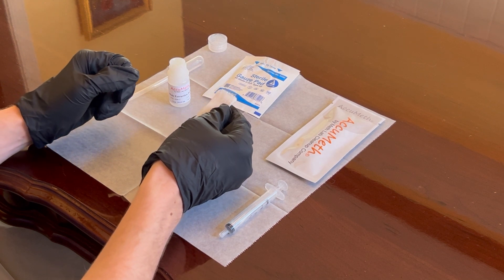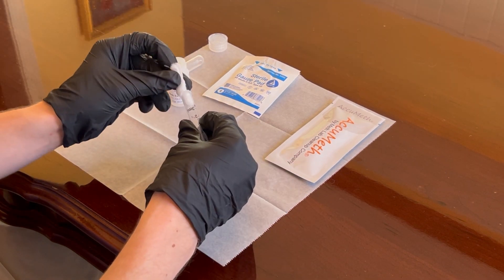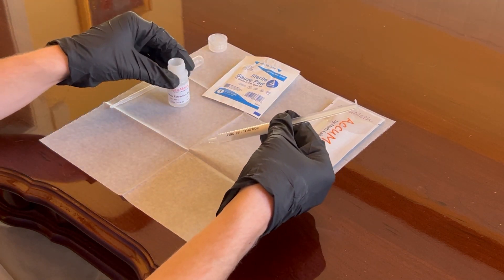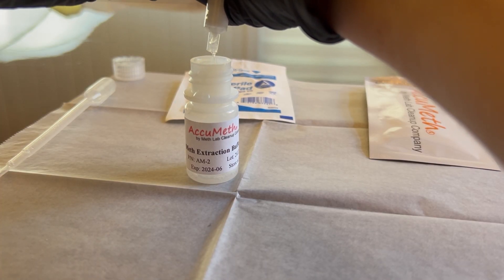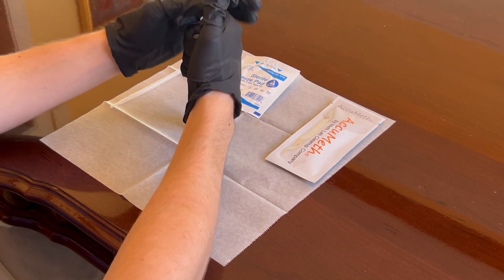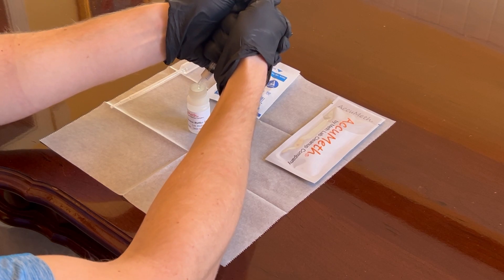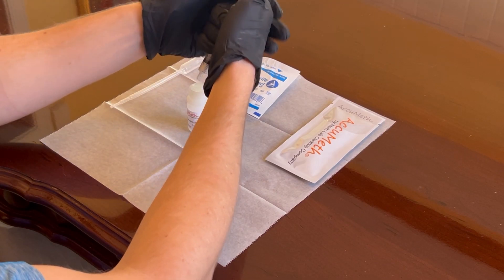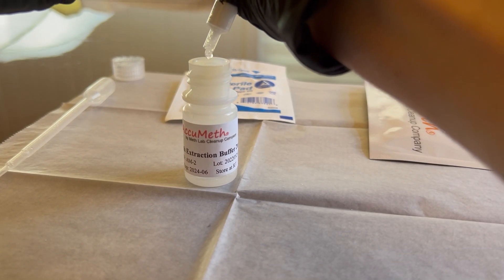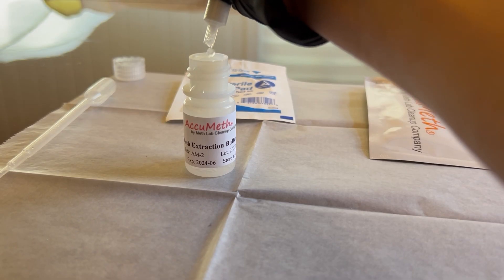Now we can return to our wax paper and test kit. Tightly roll the gauze wipe. Pick up the syringe, remove the plunger from the syringe, and then insert the rolled up gauze wipe slowly down into the syringe barrel. Reinsert the plunger and push down to expel all of the liquid from the gauze wipe into the extraction buffer bottle. Be careful not to spill the sample outside of the bottle or let the bottle tip over — we want to keep the liquid in the buffer bottle. Now draw the expelled liquid back into the syringe by pulling up on the plunger, then push down to expel the liquid back into the buffer bottle. Repeat this a third and final time, drawing up the plunger and then pushing back down to expel the liquid back into the buffer bottle.